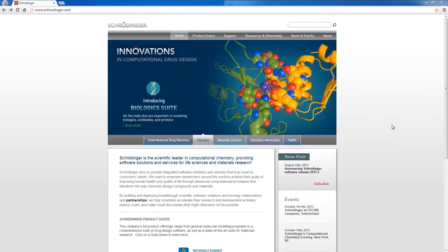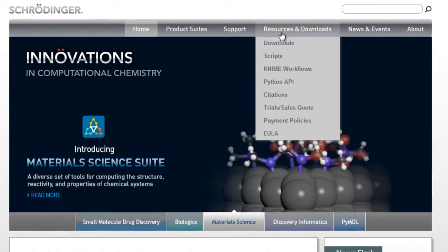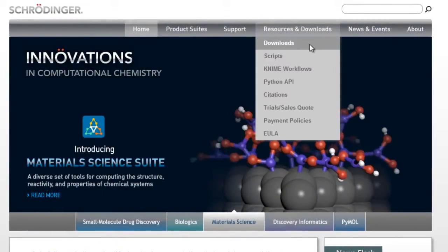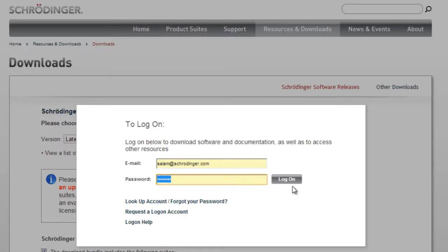To download the Schrödinger software from the Schrödinger website, first go to Resources and Downloads, then log on using your registered email and password. Click here if you need to look up your account or forgot your password.